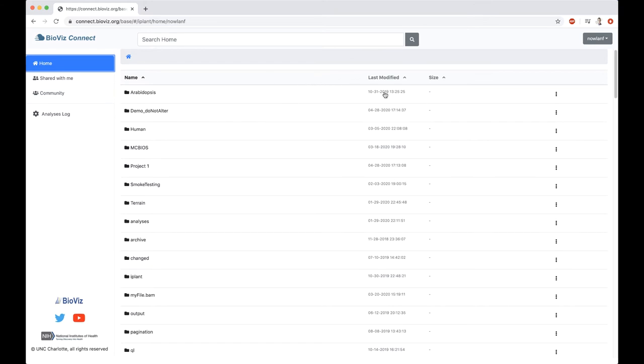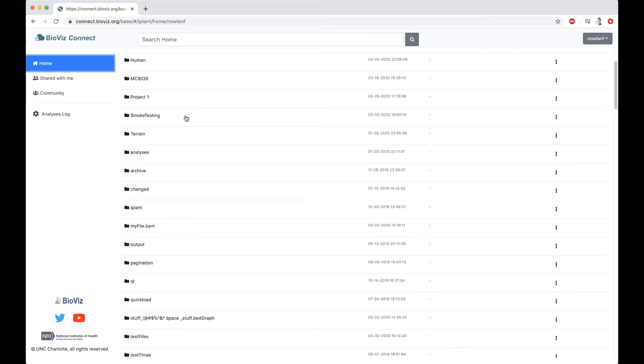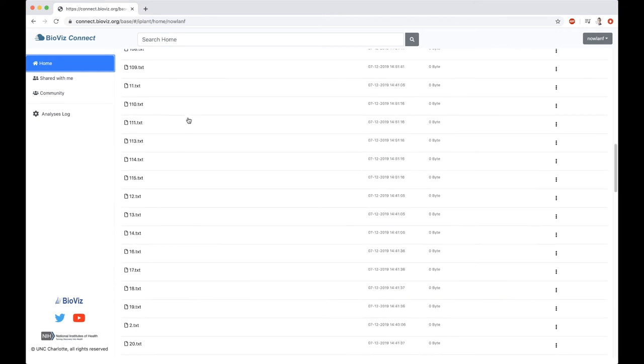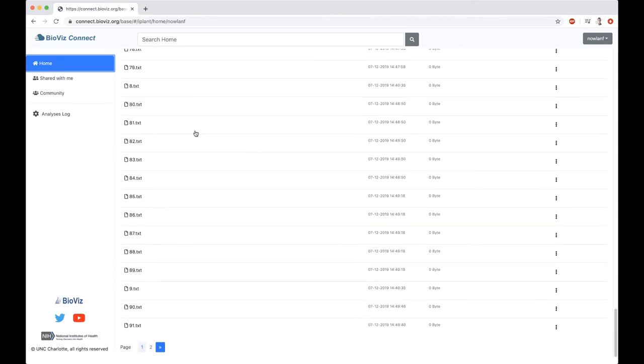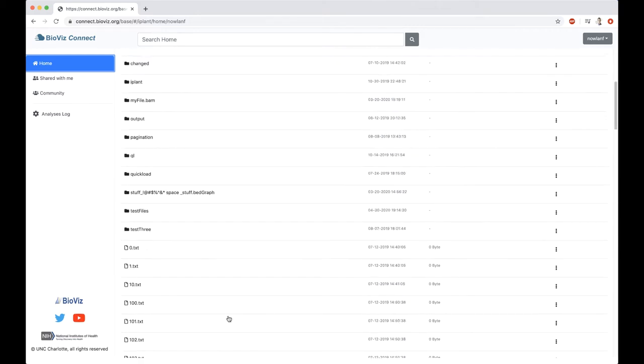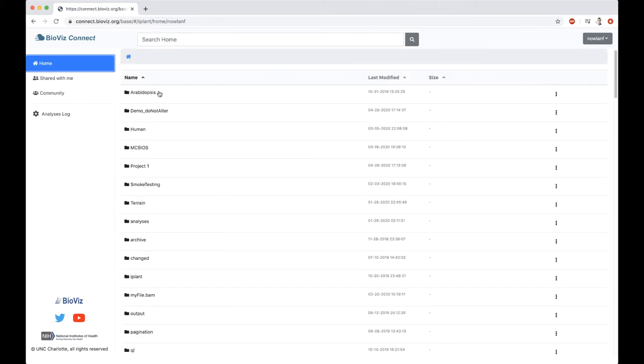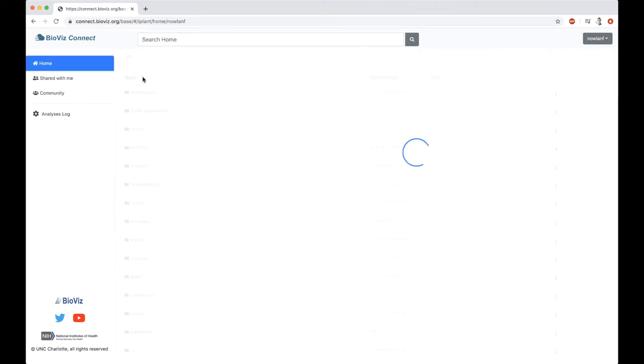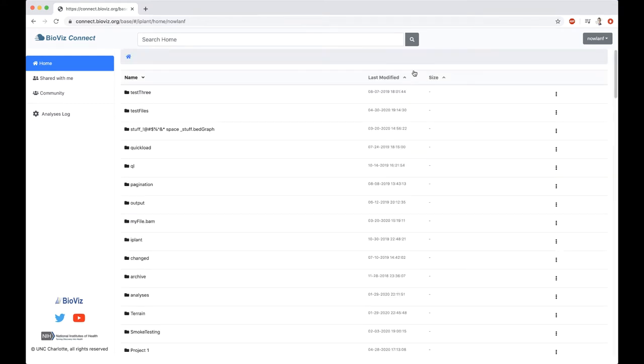In the main panel, we can see our folders and files. This is a paginated list, so it goes to 100, anything more than 100 will then be on the next page. These can be sorted by name, last modified, or size.